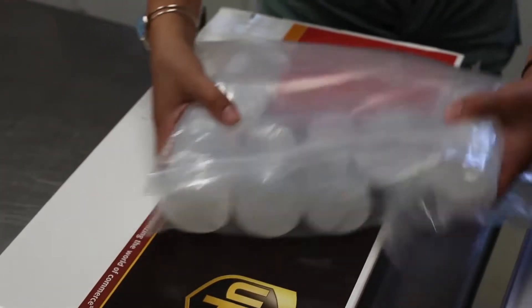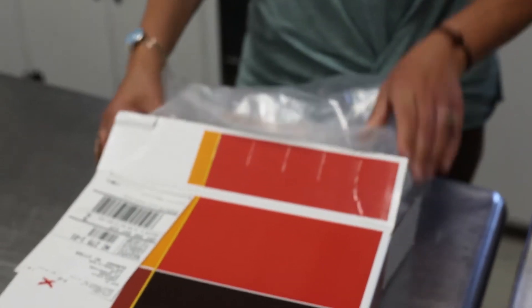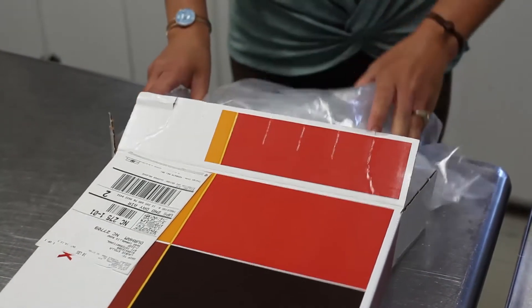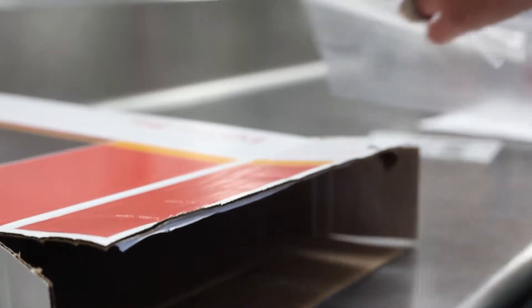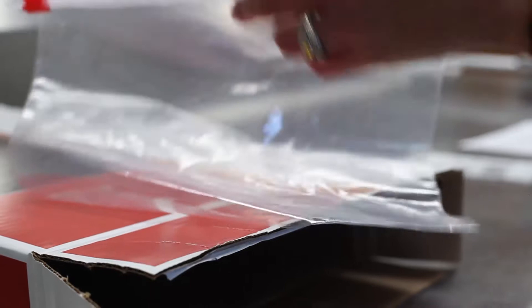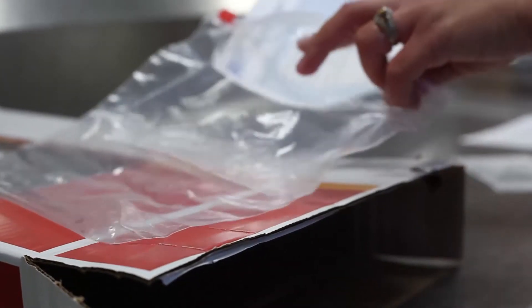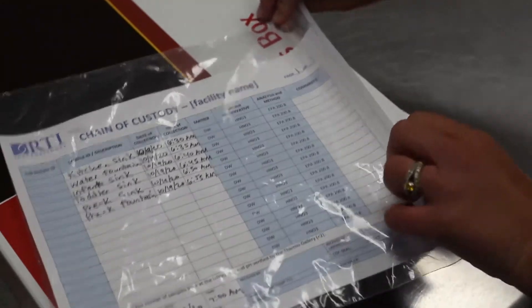Then you will place the bag in the box. Next you are going to take your chain of custody document and place it in the smaller zip lock bag to make sure that it does not get wet. Place your chain of custody in the box as well.